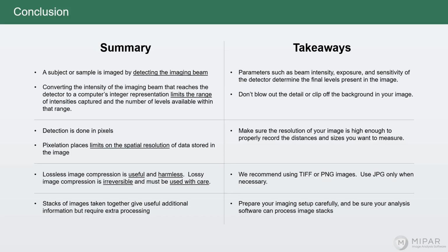Finally, we talked about multidimensional image stacks, Z series going through a volume, or a time series going through time. If you're going to take an image stack, make sure you have your imaging set up carefully, so that you don't have to deal as much with image registration and focal drift and things like that. And make sure that you have analysis software that will properly be able to handle the data that you're going to give it.